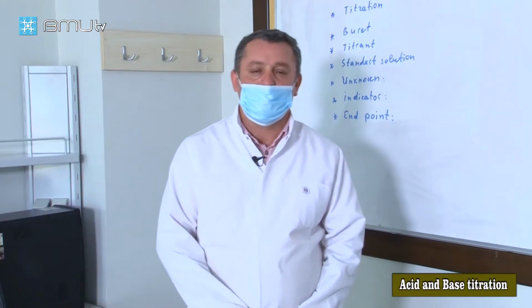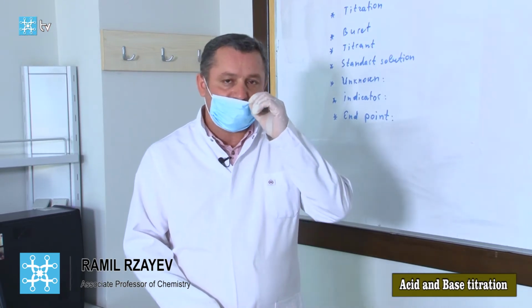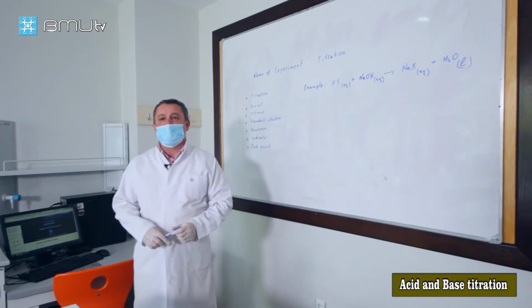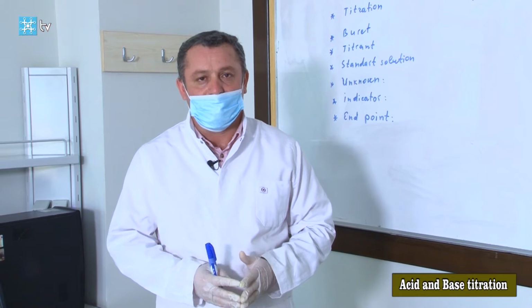Welcome to our lab lesson. Today we are going to speak about a special experiment. This experiment is called the titration process. The titration process is very well known in chemistry. Let's look at the basic principle of titration.